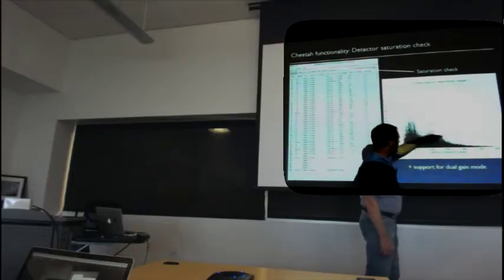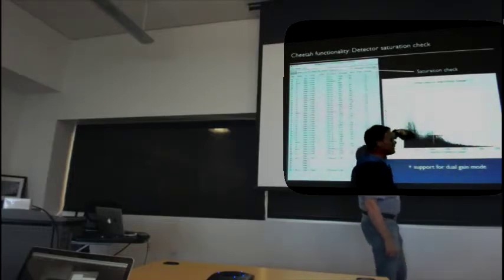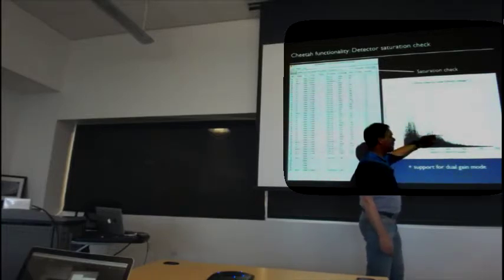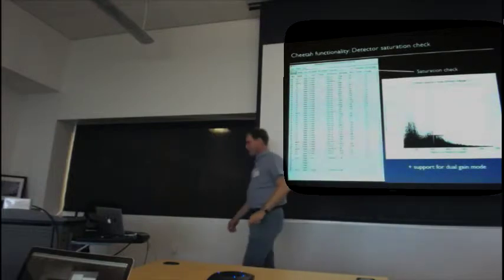But that means that rather than being clipped at this level here, we've been able to extend the dynamics. And those corrections have all been factored in. But it's a very useful way of being able to see, are we getting too many saturated peaks or not?